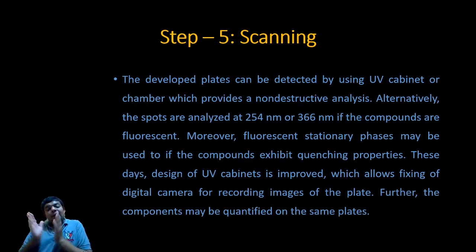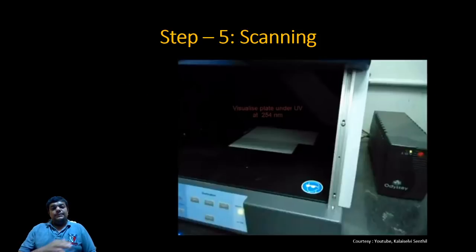We will have another point which is quantifying. So first of all, let's see what do we mean by scanning. And scanning phenomena comes into existence just after the development of chromatogram, that the mobile phase has run over the stationary phase and has taken samples along with it and has tried to separate the analytes from that mixture being placed with the help of applicator systematically at the bottom of the plate.